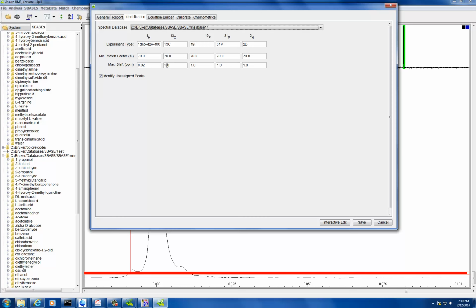This looks a bit different from what you did on screen, where you were pulling it back and forth. How Assure does it is it first identifies before it quantifies. So when it identifies, you tell it what's the max it could go, and if it fails in identification, then the quantification is not going to trust it, because it can't identify it. Then how are we quantifying this?